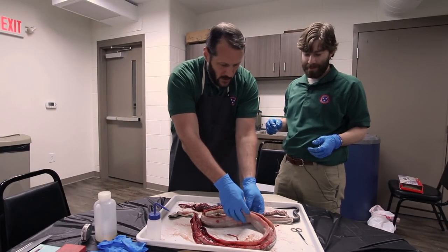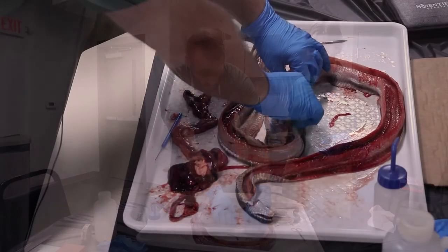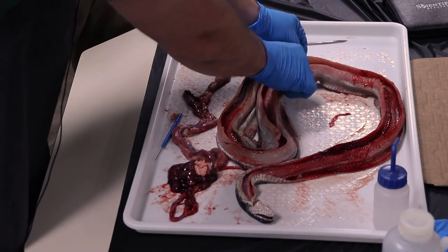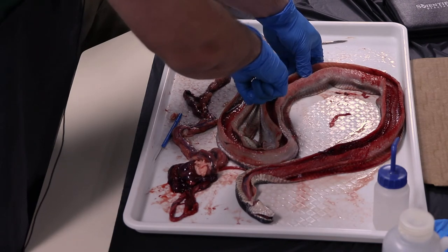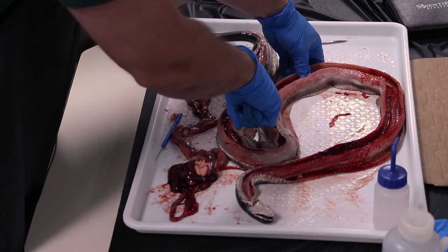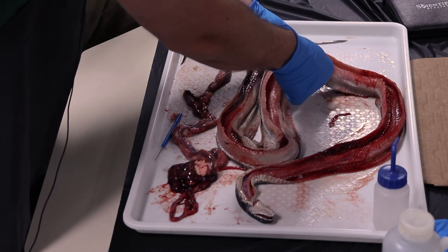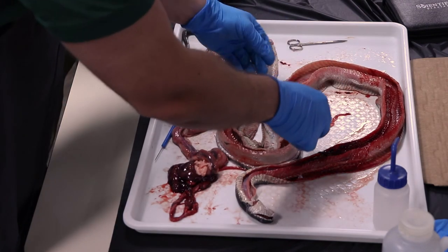Muscle and bone. So snakes have ribs, just like we do. Yep. Snakes have more ribs than any other animal in the world, I believe. And you're now looking at the ventral side of the vertebrae. They've got the same backbones that we have. And you really get a sense of just how much of a snake is muscle. They are incredibly strong for their small size.